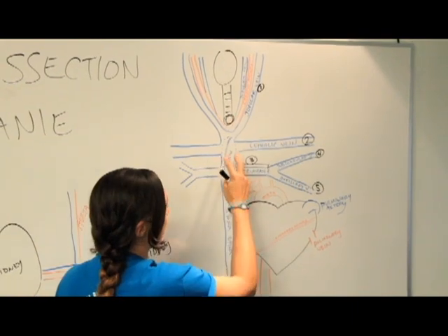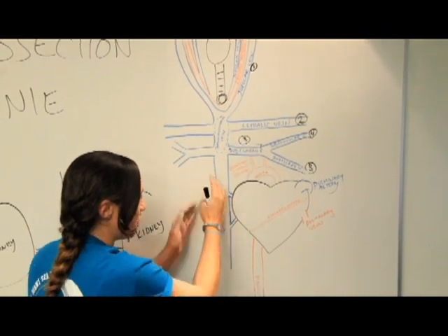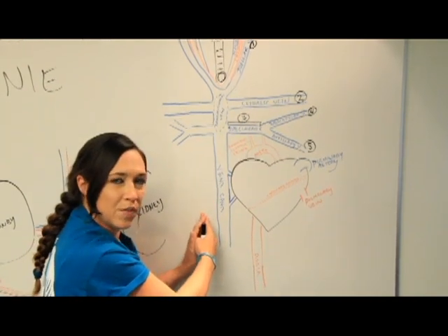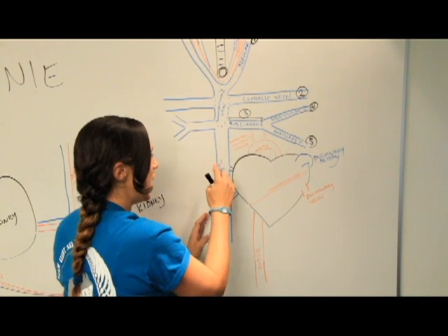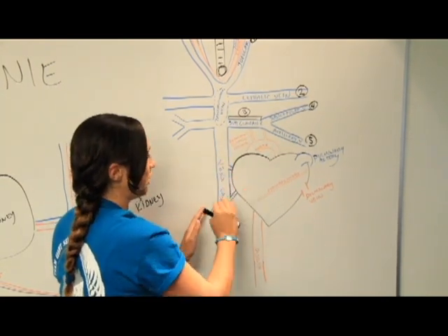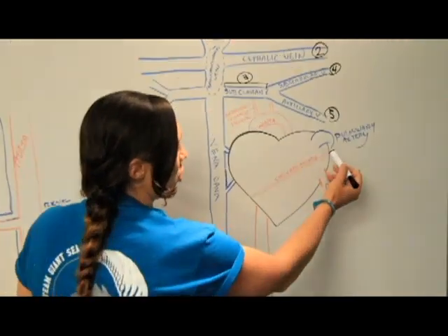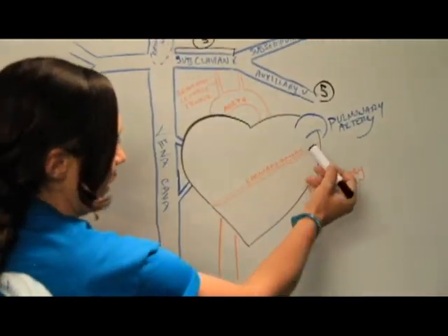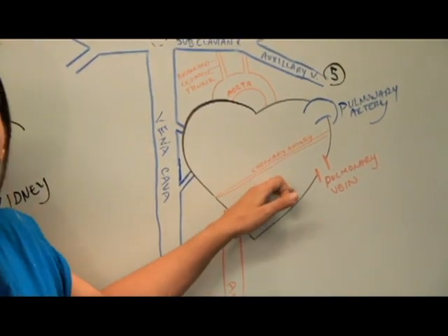Now if you come down here, this is basically where all these veins meet, this is going to be your vena cava. And we went over the vena cava a little bit with the circulatory system in the heart already. So this is your inferior and your superior, or your cranial and caudal vena cava, where it dumps into the heart. Now, going across the heart, this artery that basically bisects the heart at an angle, that's going to be your coronary artery.